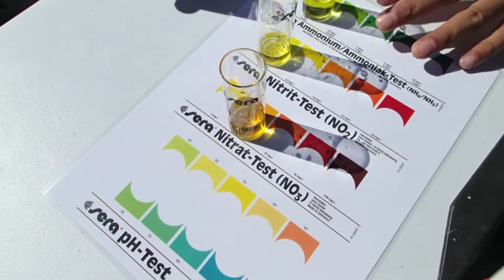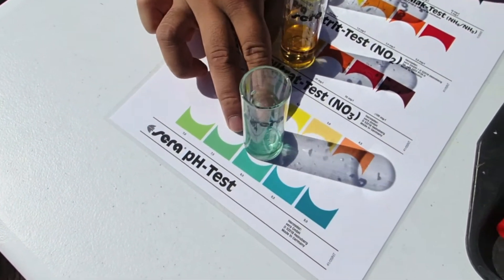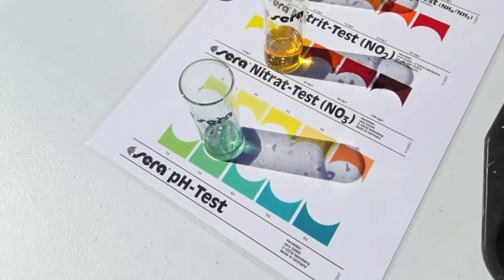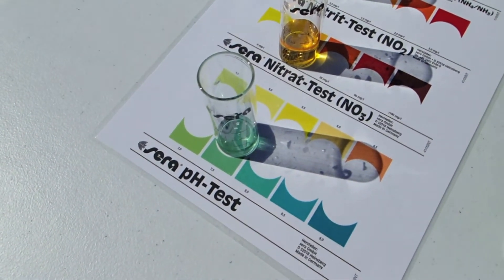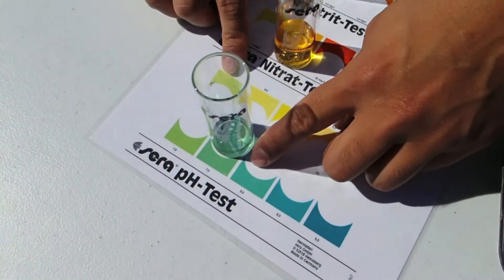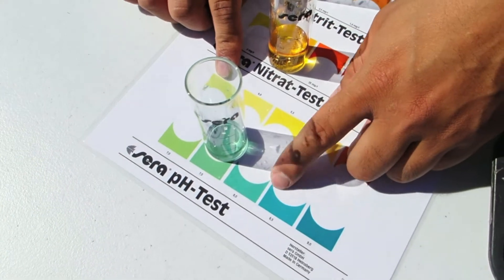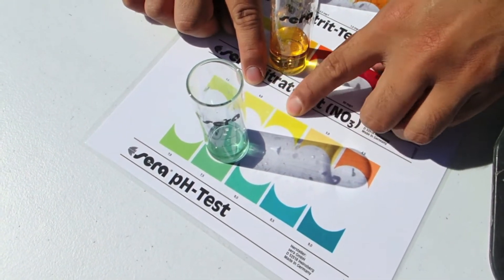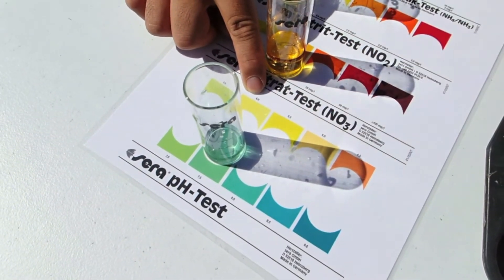The husbandry is very good for this koi pond. Anything above 50 milligrams per liter is poor husbandry — they'll need to do further water changes. So the other thing we test is pH. This pH is sitting at about seven and a half, so that's pretty good. For koi, you'd like to keep them between six and a half to seven and a half. They can tolerate up to eight and a half with no problems, and probably down to six is okay, but you wouldn't want them to go any lower.